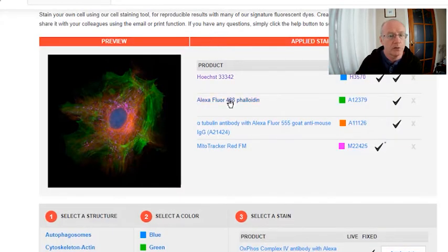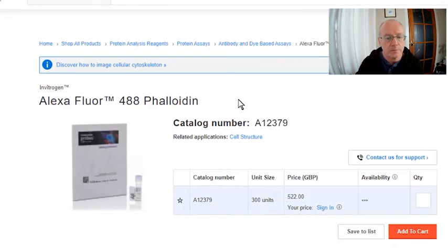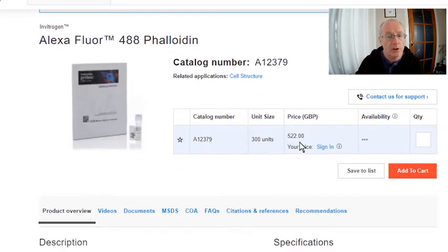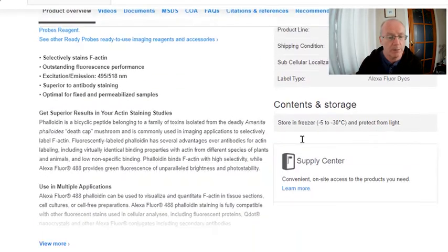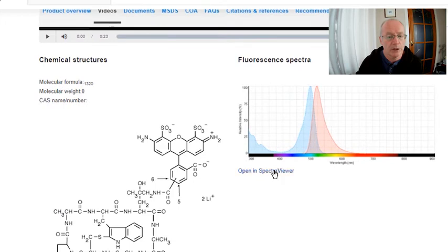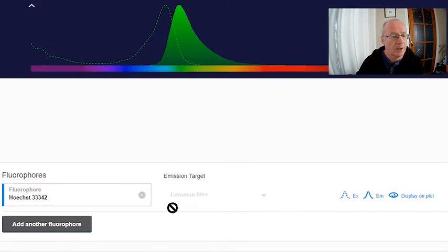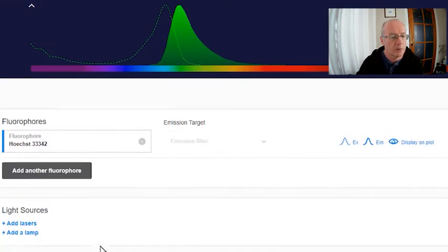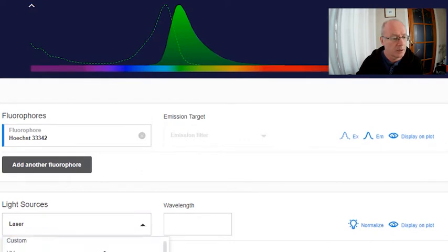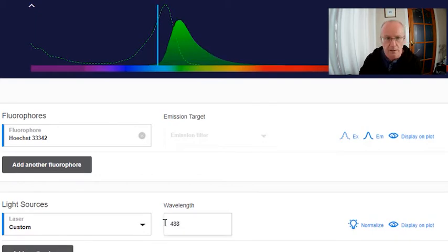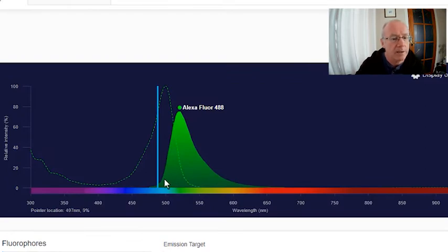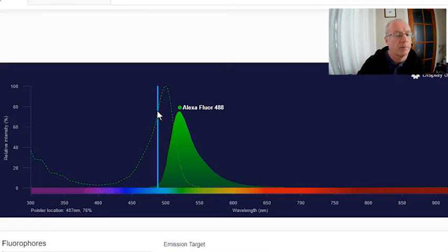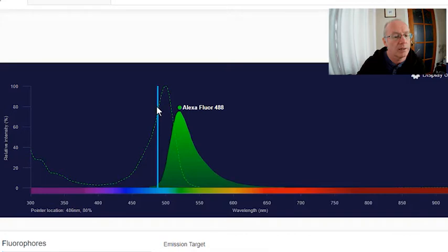What about Alexa Fluor 488 phalloidin? 522 pounds. So you can see how these things can be quite expensive. Now, here's my fluorescence spectra. Let's open it in the spectral viewer. Let me add in my laser. So I'm going to add a custom laser and give it the exact excitation. So my argon ion laser. And what we see here is that it certainly intersects with the excitation spectra. And it looks like we might get about, what would you think, maybe 75 percent efficiency with the Alexa Fluor 488.